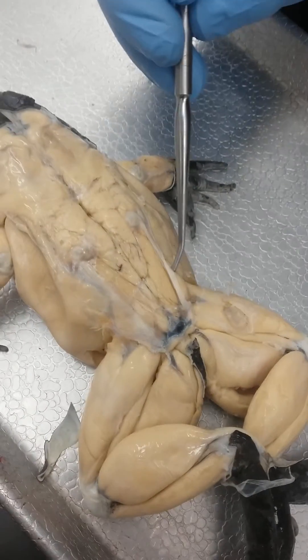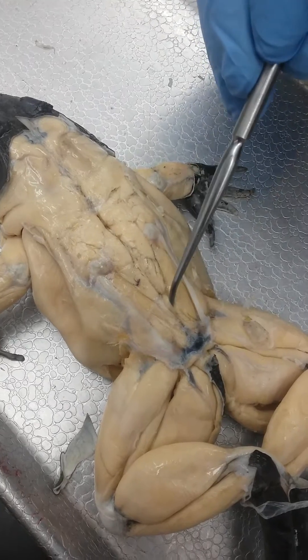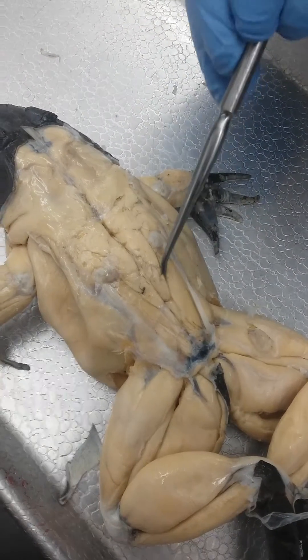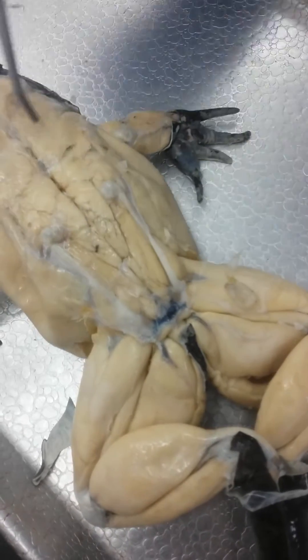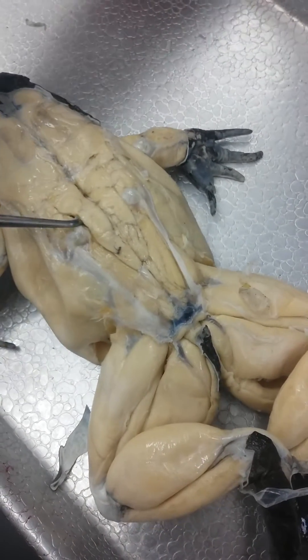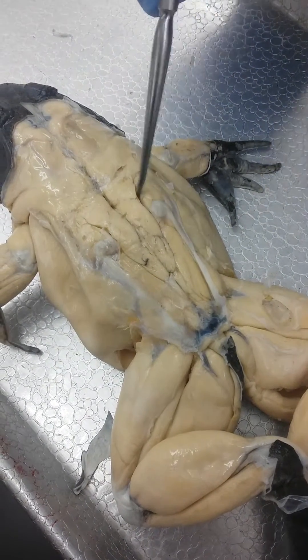This right here is the butt cheek — this is the gluteus. And then right here underneath, this is coccygeo-iliacus, running along the sides. And then this right here is longissimus dorsi.